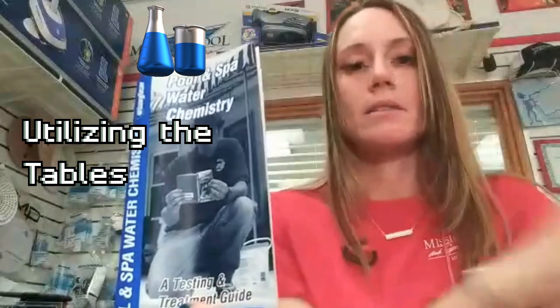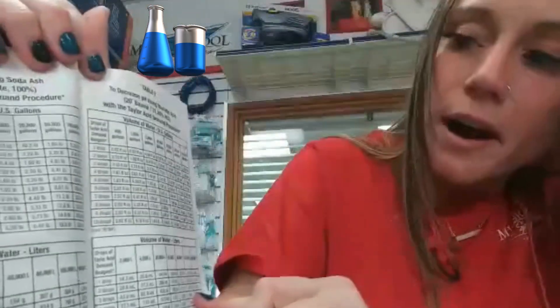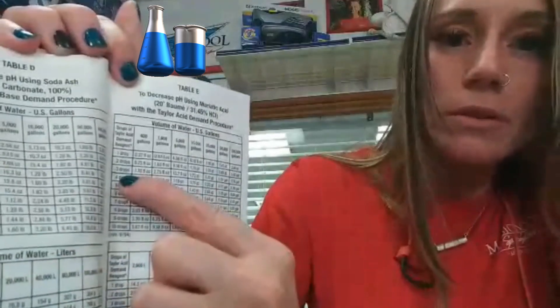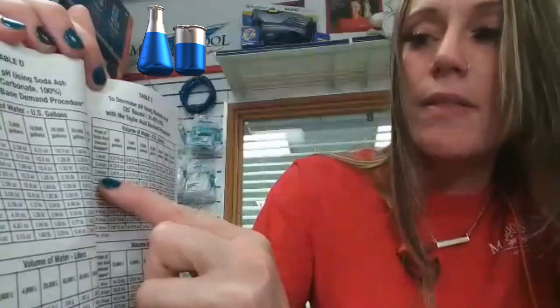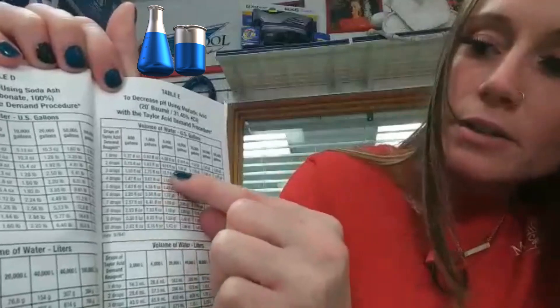So we're going to get our Taylor Pool and Spa Water Chemistry book, which you'll find in the back of your Taylor complete test kit — it's on page 57. There's a table that breaks it down pretty simply. It gives you how many gallons of water, from as little as 400 gallons up to 100,000 gallons. If you fall in between, you'll have to do the math. Since we did three drops, I'm going to go down to three drops — they're in order by increments of one drop — and let's say it's a 10,000 gallon pool. I'll follow across until I get to 10,000.